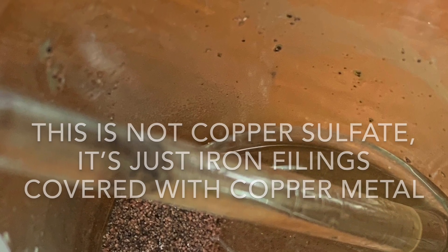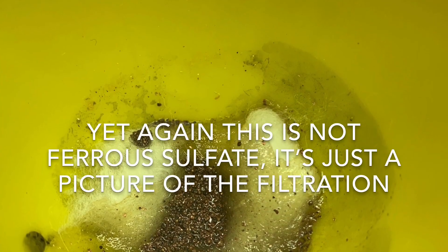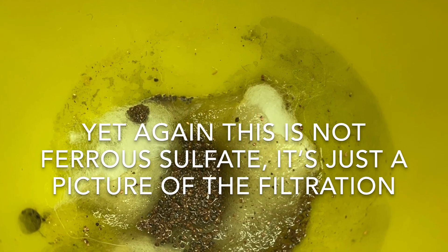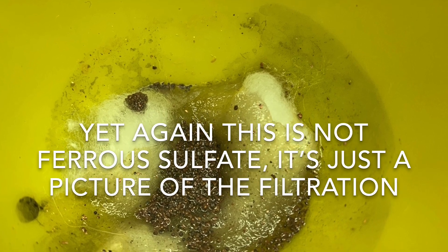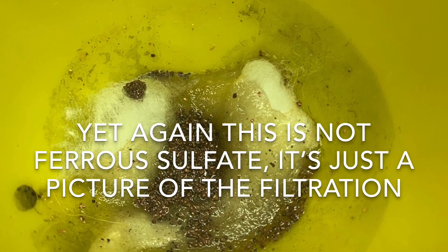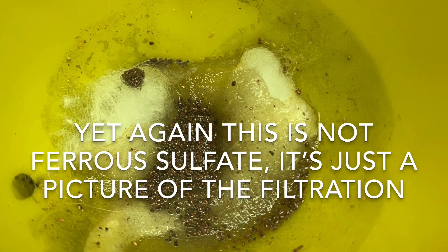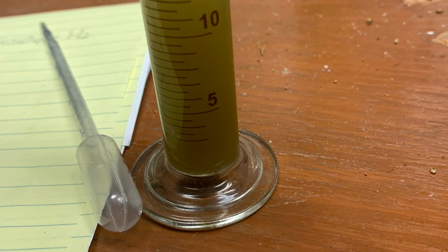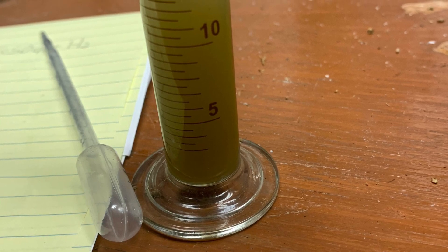Then I added one gram of iron filings to this beaker, and what this did was exchange the sulfate anion to the iron, which is already oxidized to the plus two state, forming iron two sulfate, and the copper from the copper sulfate liberated as a metal.